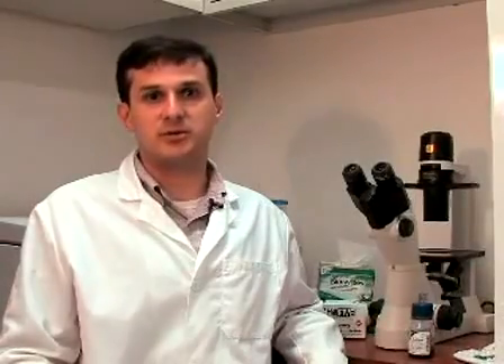We're in the tissue culture room now, and before I show you what a confluent flask of human precursor cells looks like, first I'm going to prepare the tissue culture hood. First, I'm going to turn off the UV.